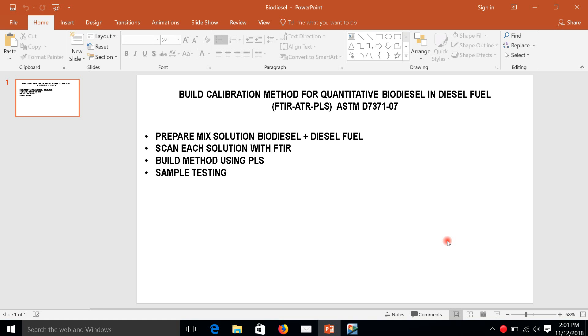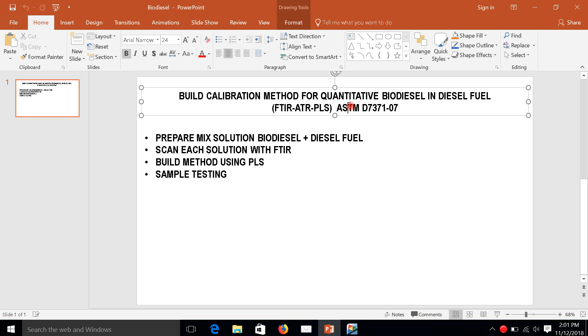Hello, how are you? Today we will build a calibration method for quantitative analysis of biodiesel in diesel fuel. We use FTIR plus ATR accessory using PLS method. This method refers to ASTM D7371-07.